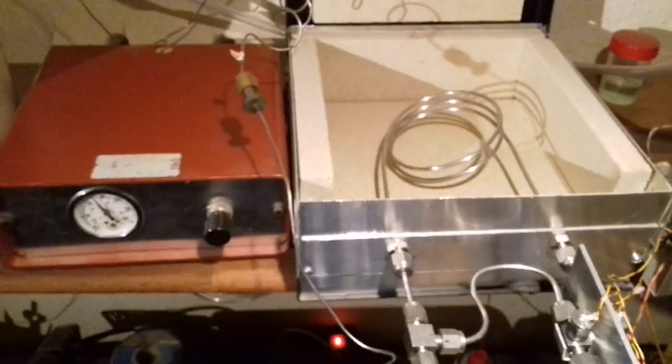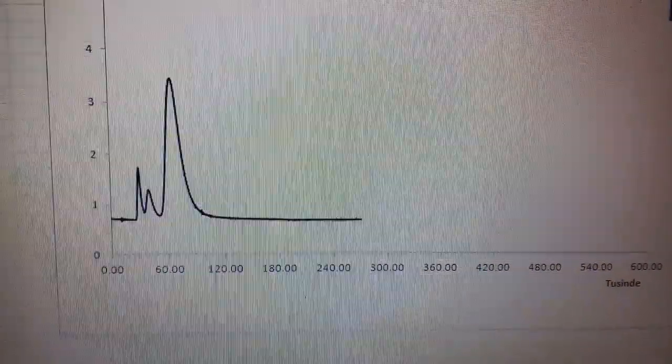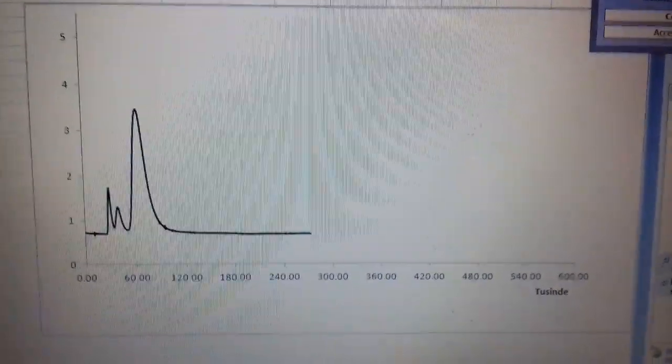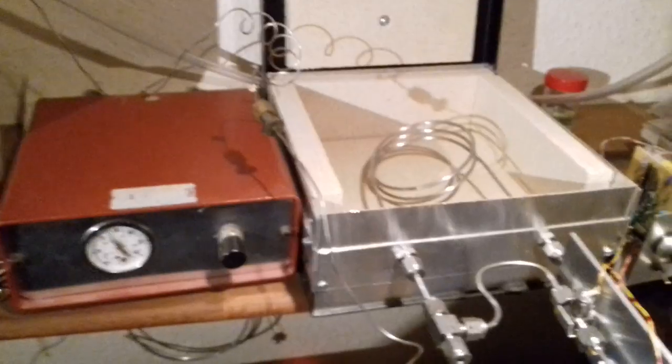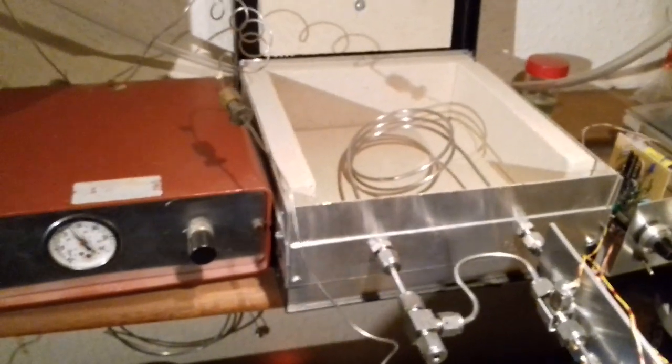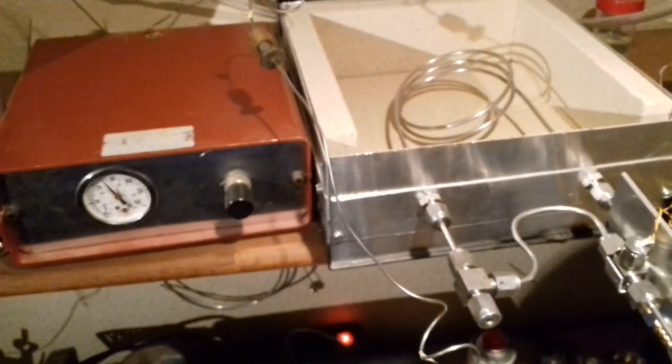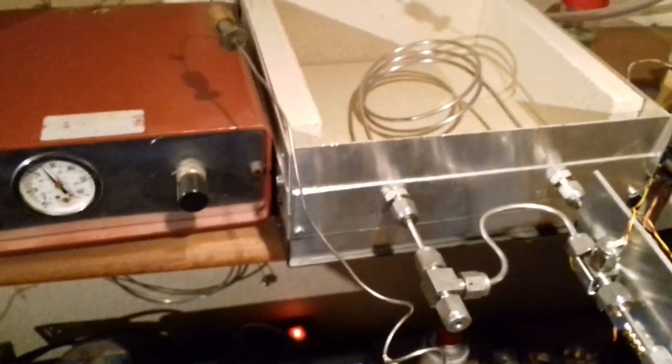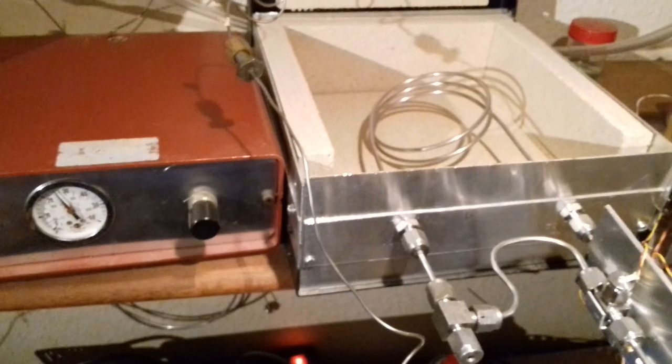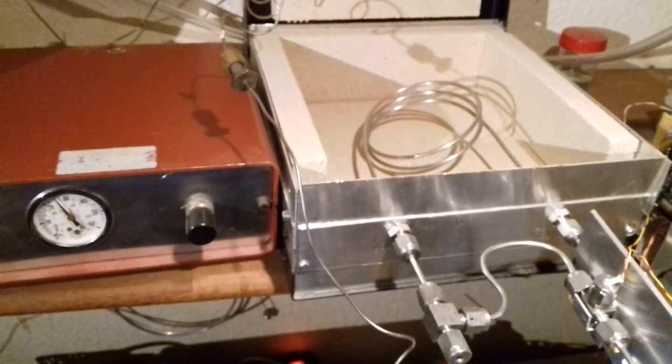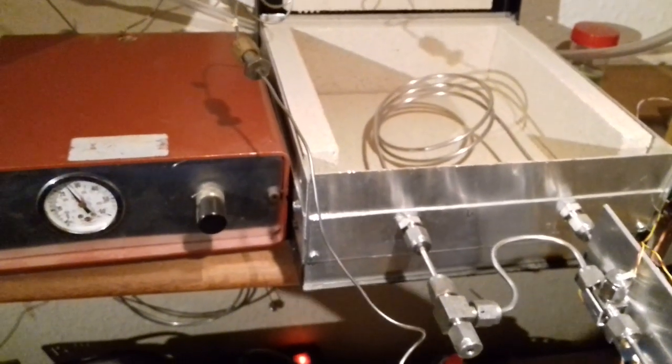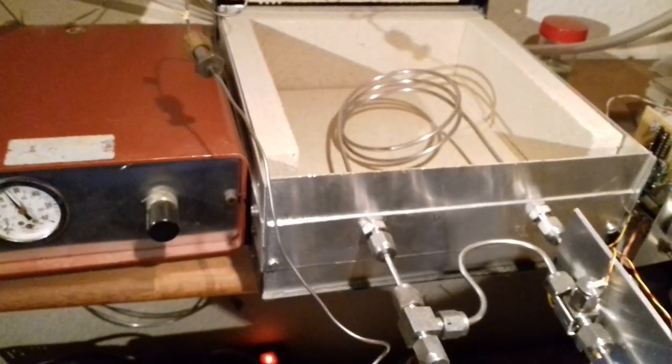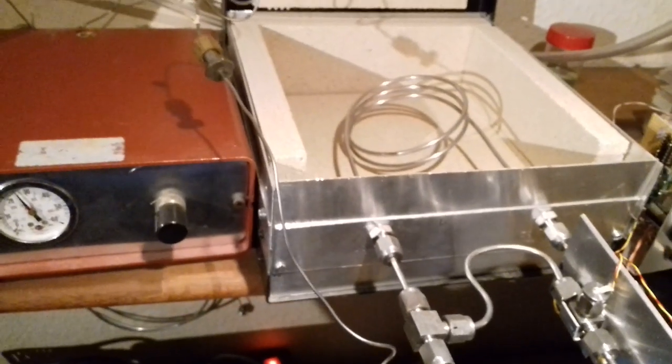It actually does work. As you see, the baseline is keeping fairly steady. So that's the project, and it works for now. I might do some more videos on the different components, how I constructed them, and what I want to do in the future. Maybe explore some more details of the theory behind it.